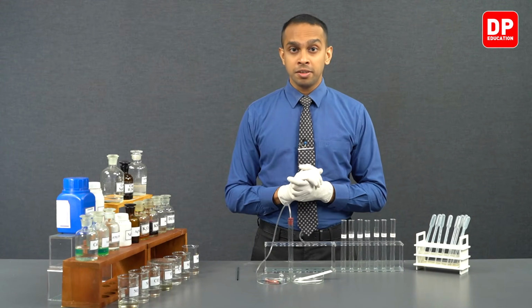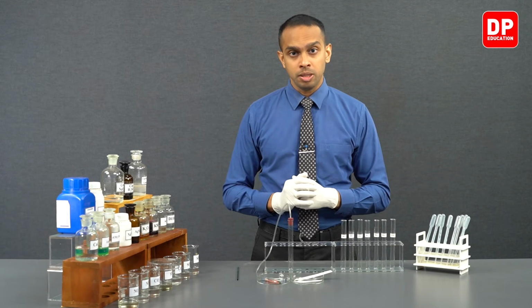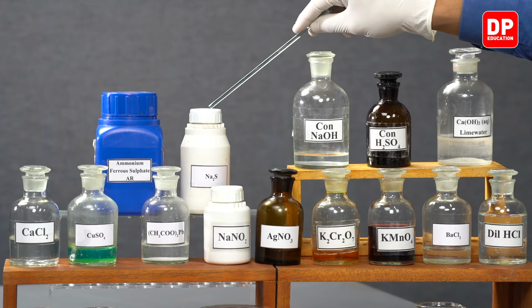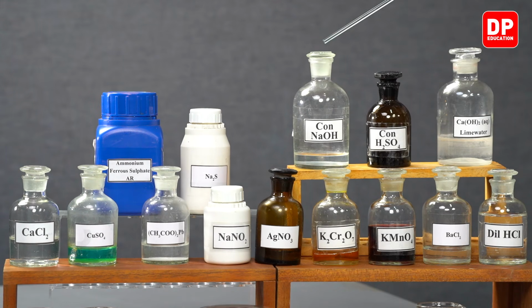Now, let's identify the chemicals and the equipment we'll be using for this experiment. We will be using ferrous ammonium sulfate, sodium sulfide, sodium hydroxide, sulfuric acid.